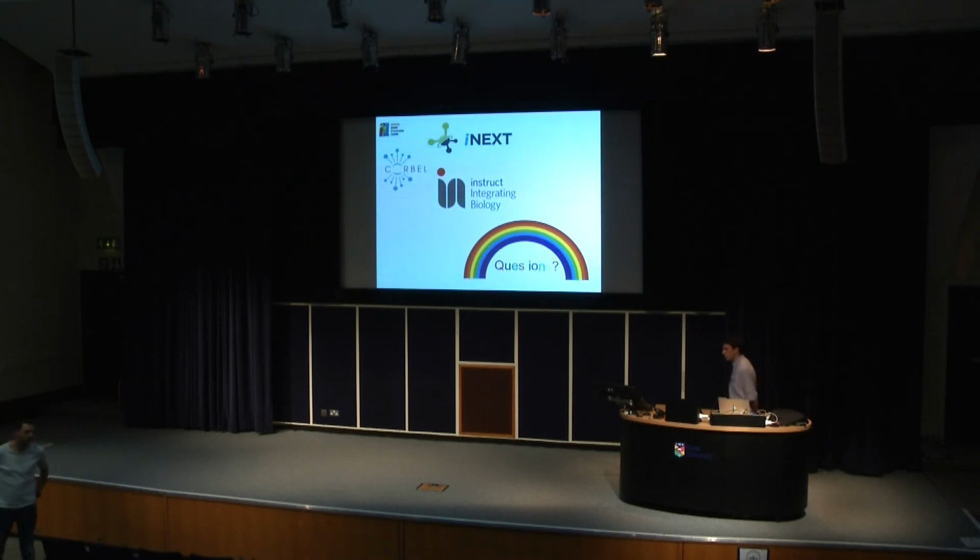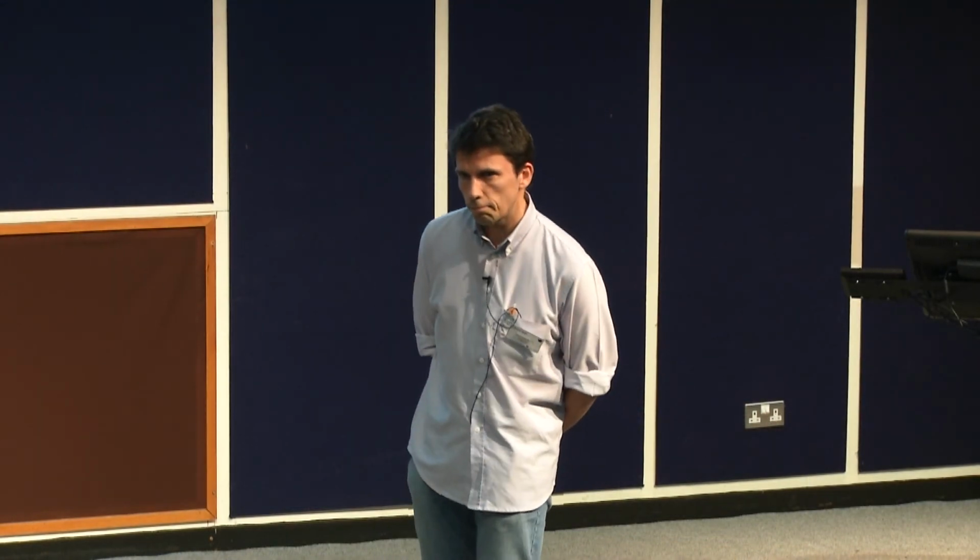Just a quick, well, thank you for this talk. It's certainly very inspirational to try all different packages. My question is, have you found any particular order of different packages to be used, for instance, in the 2D classification? Does it matter if I start with Relion and move on to something else, or do it the other way around?